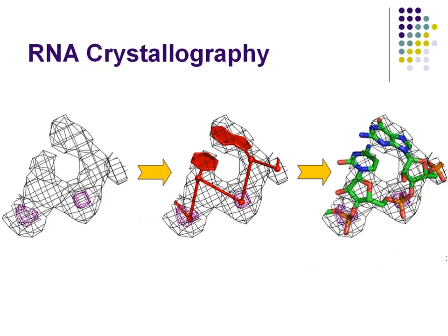So if we jump back to the slide that I showed before, this figure in the middle here looks pretty much like the pseudotorsions that I was just talking about. This figure over here looks pretty much like the RNA backbone conformers. So the main trick with RCrane is it helps you place phosphates and bases and then uses the pseudotorsion information and the p-perp distance information to predict and build the appropriate conformer.